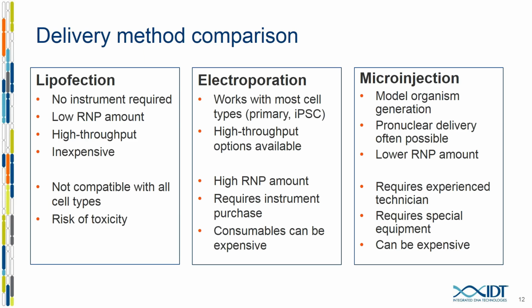So this can work very well. The only caveat to electroporation is that up front it does take some optimization effort to make sure you have all the conditions just right to work well for those cells so that you have good delivery and high viability of those cells.